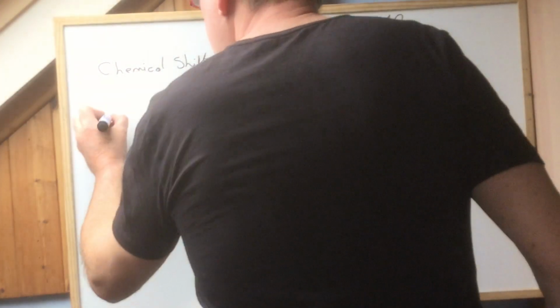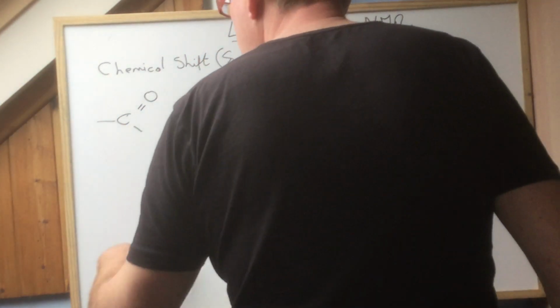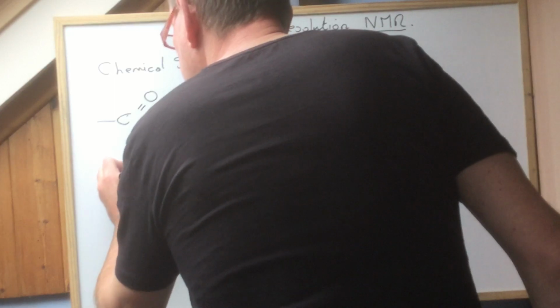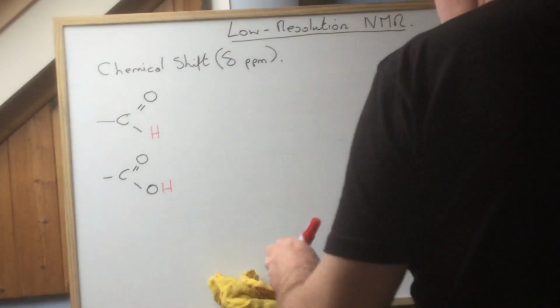Okay, now C double bond O, H, two more, C double bond O, O, H, right up the far end of the chemical shift region.